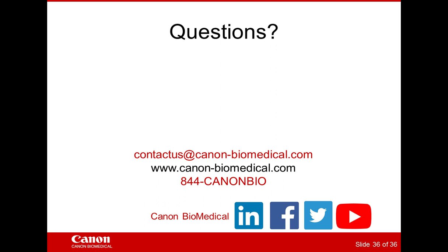So if a lab didn't have bank samples tucked away with characterized copy number changes, they could still bring in the assay and use readily available Coriell controls. That's why we started there. But absolutely, if you have characterized samples tucked away or have access through a colleague of yours, feel free to use them as your controls for the copy number assay. They will work absolutely fine.